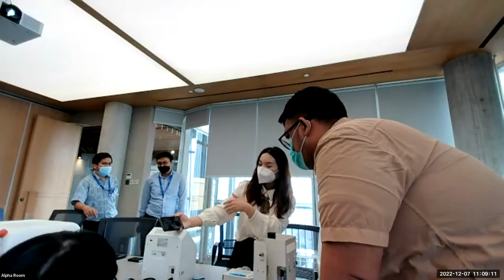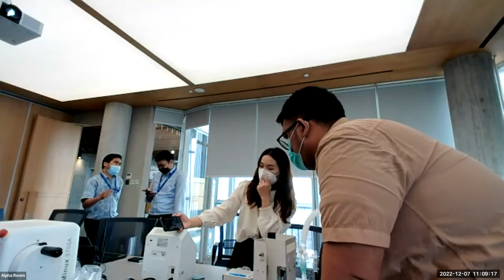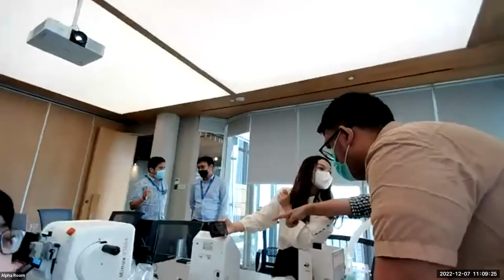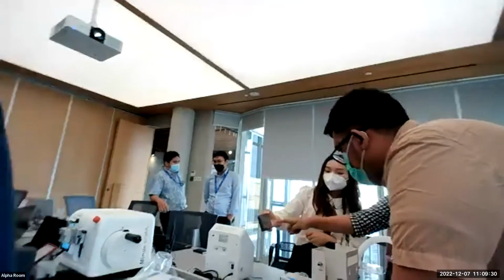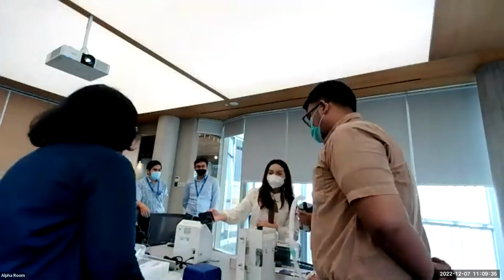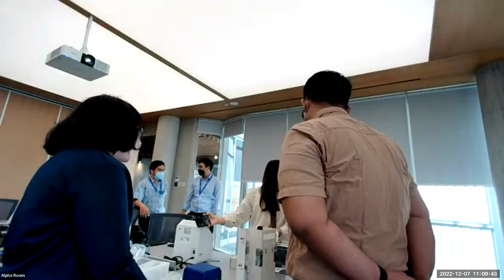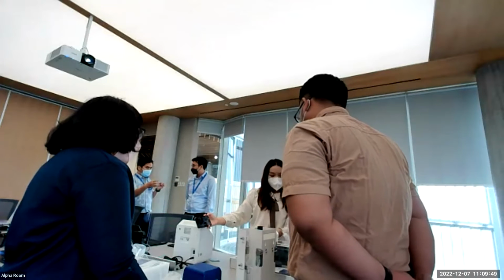And if you put the large canister on this machine, then you can weigh it. You can get the weight of the canister, because there is a scale under the canister. So if we use the canister, it will get heavier.